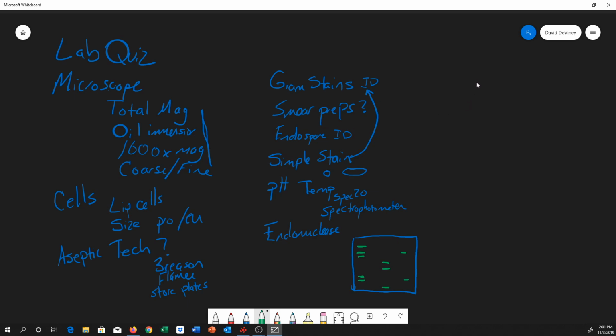The other thing that we did that I didn't ask you questions on had to do with isolation streaks, right? So remember you had your plate, you struck here, you flamed your loop, you drug, you struck through, you flamed your loop, you drug, you struck. How would you have known if you were successful there? Well, remember, the only thing you're looking for is if you have nice individual colonies somewhere.